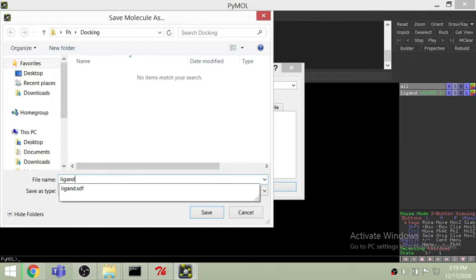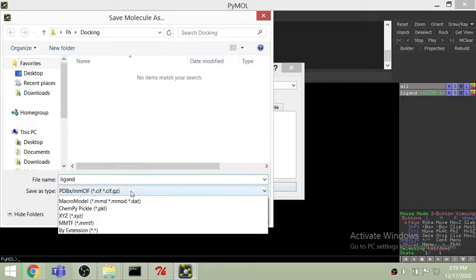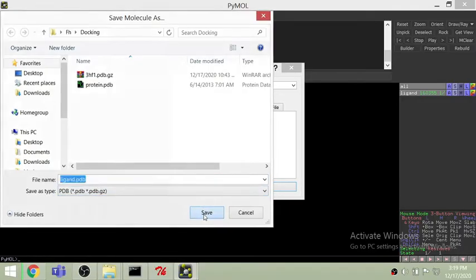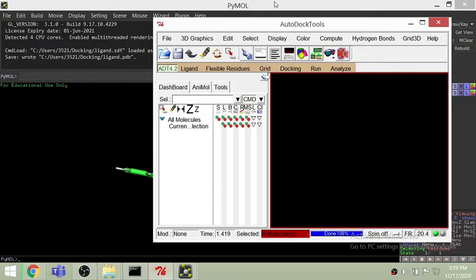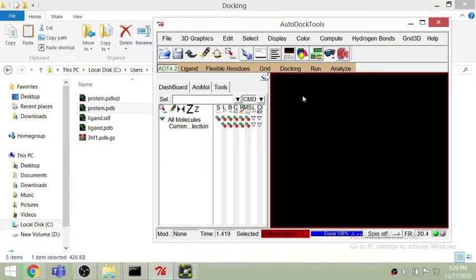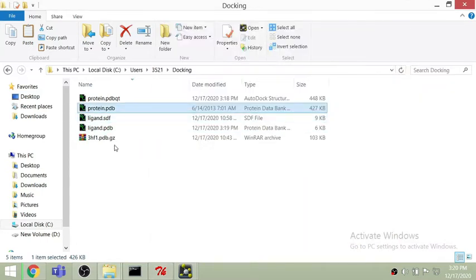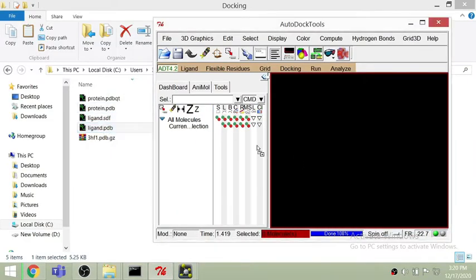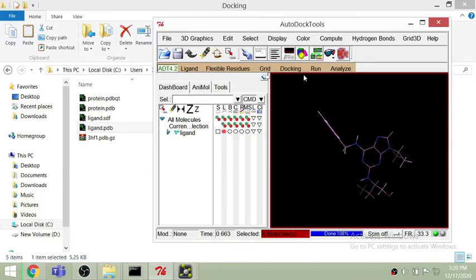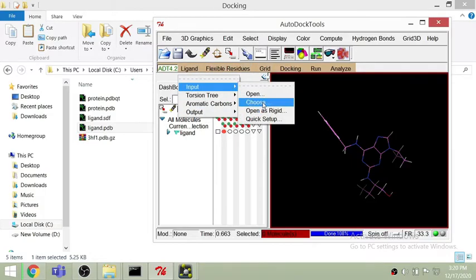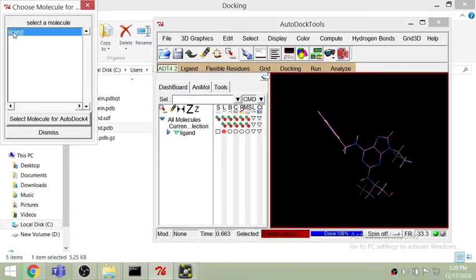The file is now saved in PDB format. Now we have the PDB file of the ligand as well as the PDB file of the protein. Next, go back to AutoDock Tools and drag the ligand file in. You can see this is the ligand — the inhibitor which we will use to find the target site in the protein. From the Input menu, follow these steps.